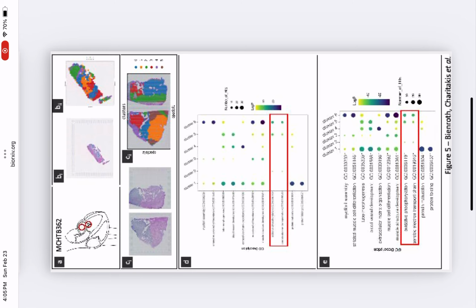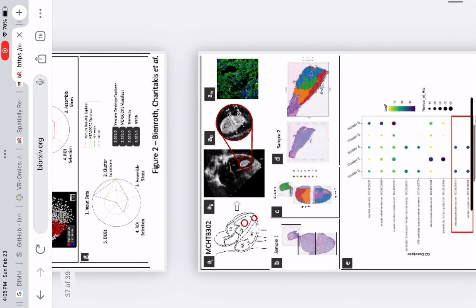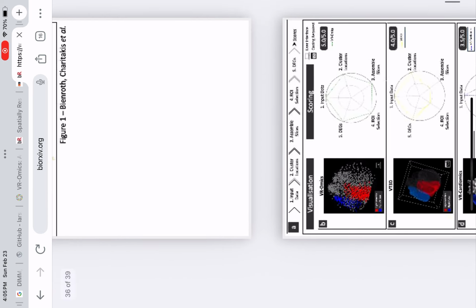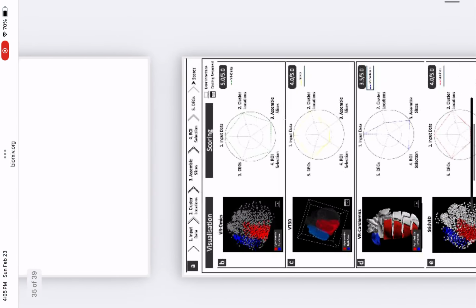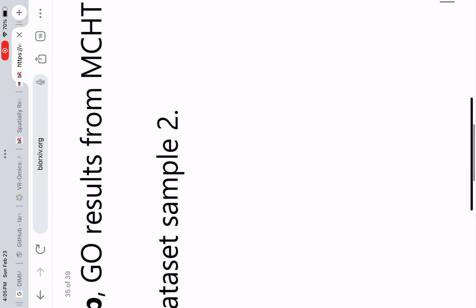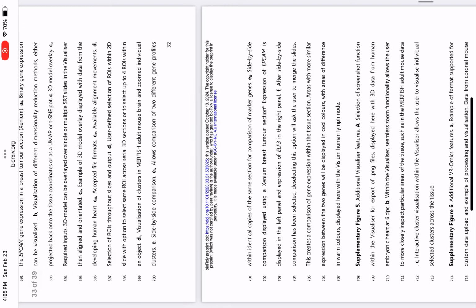Visualizer capabilities. Across these SRT platforms, different terms are used for the smallest individual capture area of each technique, for example, spots, locus/loci, bins, or locations. For consistency, we will henceforth use the term locations, always referring to the smallest individual capture area of the respective SRT methods. After processing their data through the automated workflow, AW, or loading the requisite files, irrespective of the data platform used, users can explore their datasets within the visualizer. The visualizer offers an array of interactive features designed with input from biologists to create intuitive analysis tools and ensure availability of the right resources to address various biological questions.